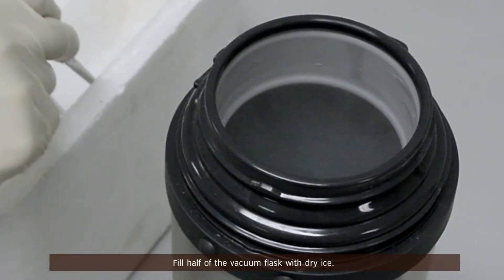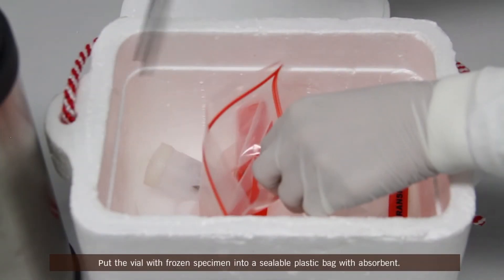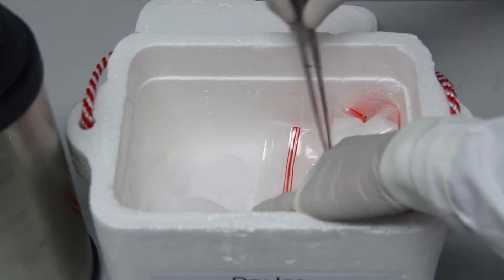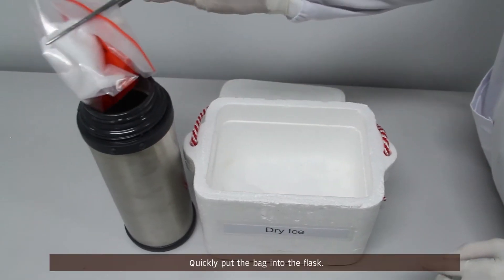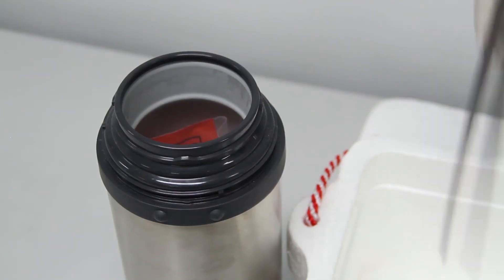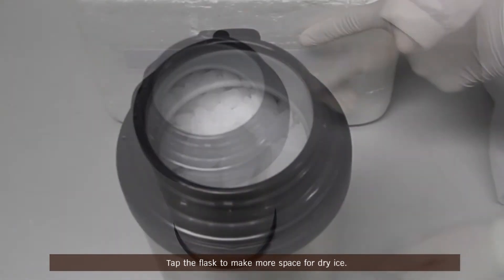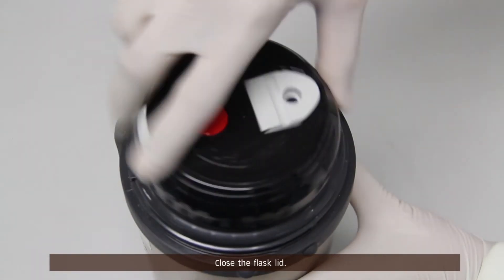Fill half of the vacuum flask with dry ice. Put the vial with frozen specimen into a sealable plastic bag with absorbent. Fill more dry ice until the flask seems full, tap the flask to make more space for dry ice, then fill more dry ice until the flask is full. Close the flask lid.